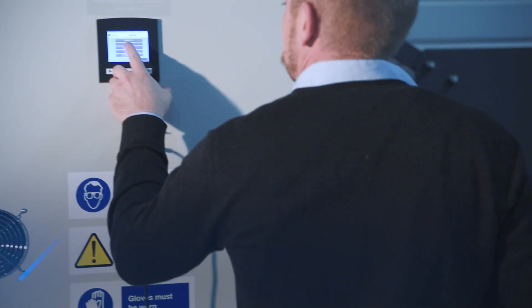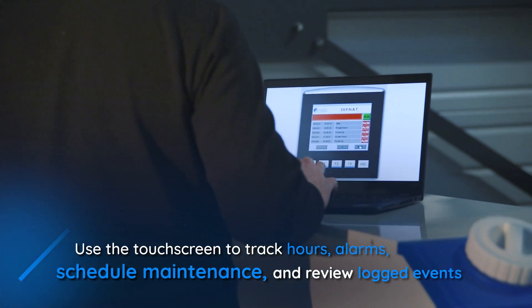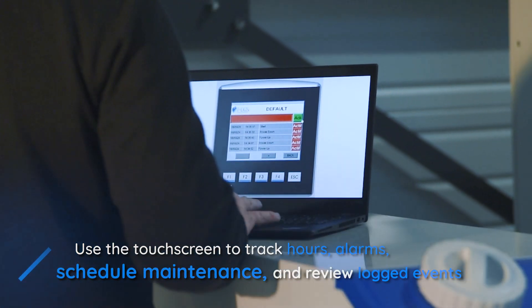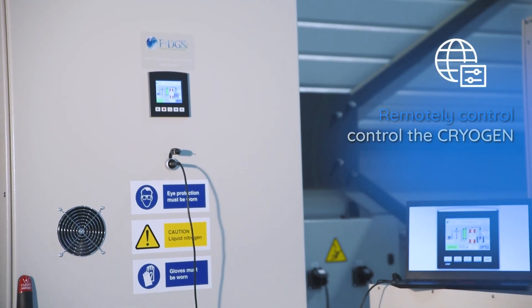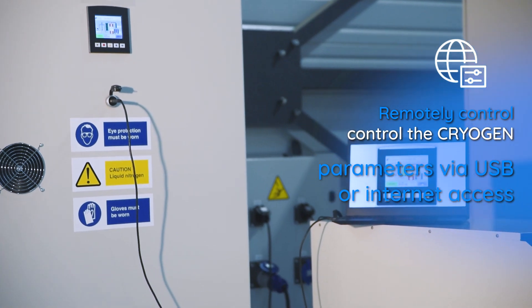Stop cryogen generation via the touchscreen. Remotely control the cryogen parameters via USB or internet access.